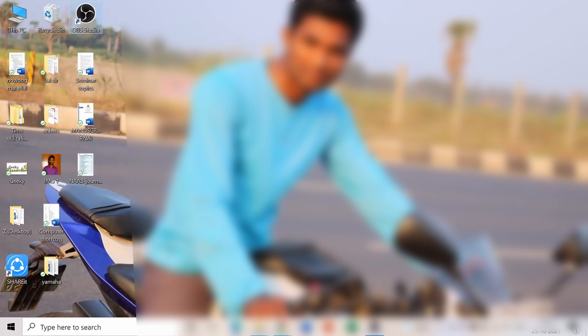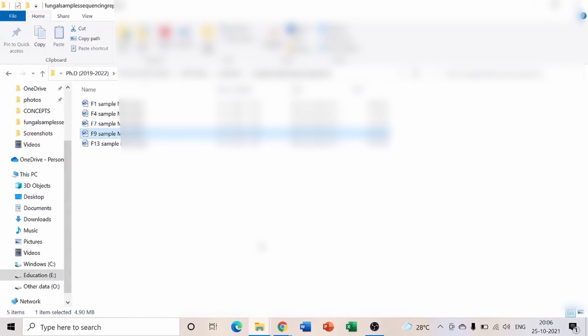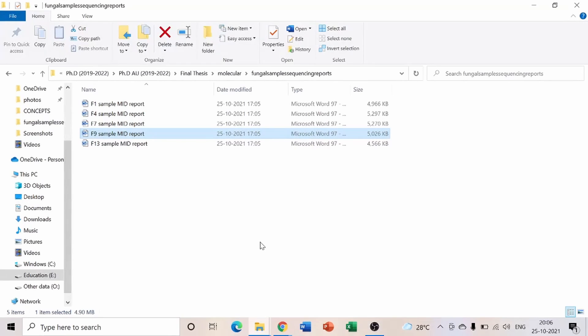This tutorial covers how to deposit fungal or bacterial cultures in a sequence database once you receive a report from a sequencing organization. When you send cultures to a sequencing company, you receive two files back.